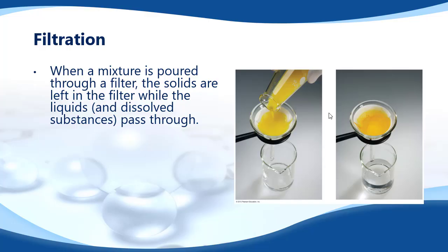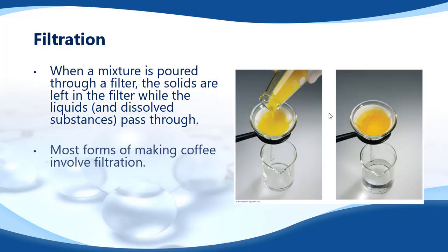There are different ways to fold it. I'm going to show you one of the more common ones, which is the one that they have in this example here. And what's going to happen is that anything that is soluble in water will pass through the filter paper into the bottom, into what's called the filtrate, which is what we collect in the beaker below. Anything that doesn't dissolve in water, any precipitate, gets left behind in the filter paper.